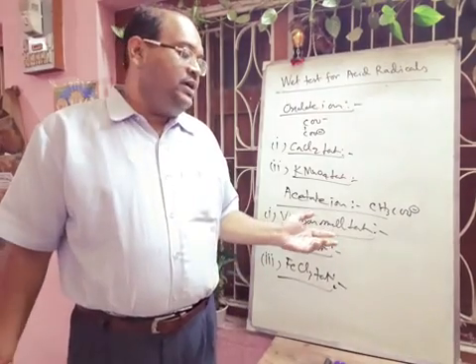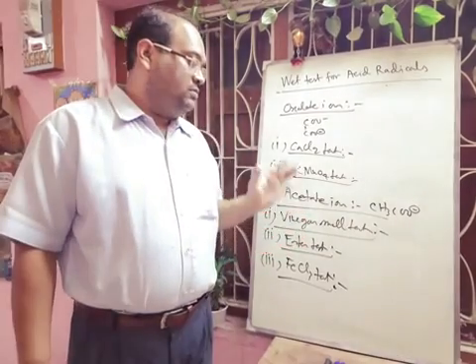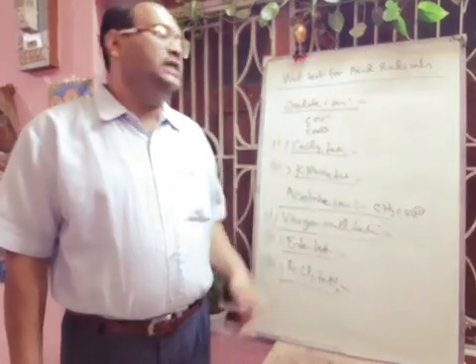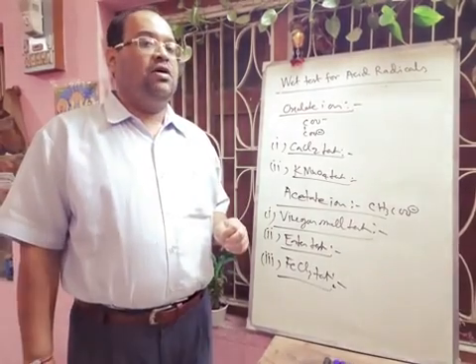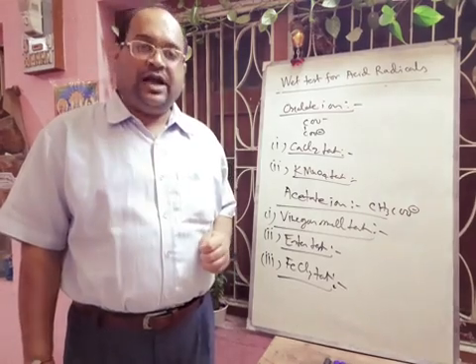So in this way we have discussed the confirmatory tests of the acid radicals, and next day we will start the special tests or group separation or confirmatory tests for base radicals. So today, up to this. Thank you.